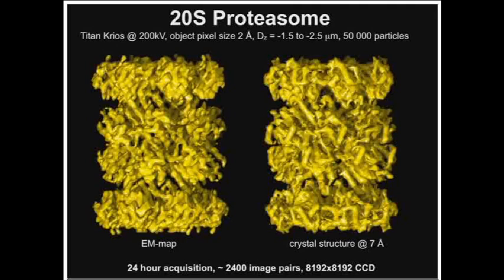And that's a major issue with the cryo box I mentioned at one point. It's the temperature around the sample. One of the arms was not right in temperature, and so you had to investigate which of these arms were too warm, which did not drag away the contaminants but just gave the contaminants back to the sample. Also, there were some problems with the seals of the microscope. There were plastic seals instead of metal seals. They have exchanged them, so now everything is going a little bit better.